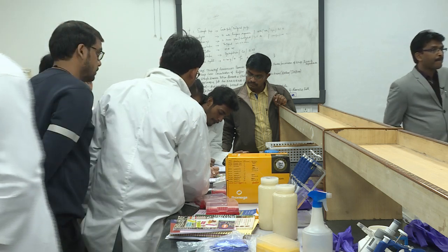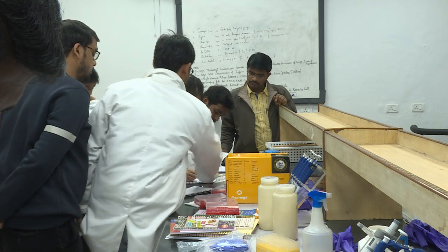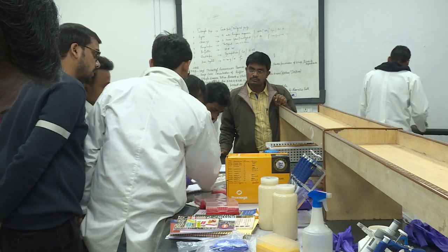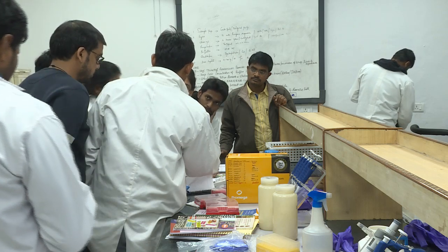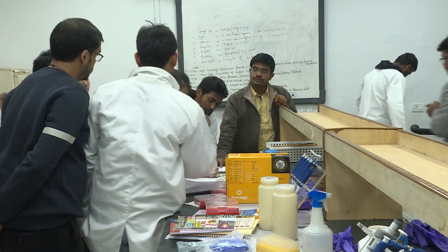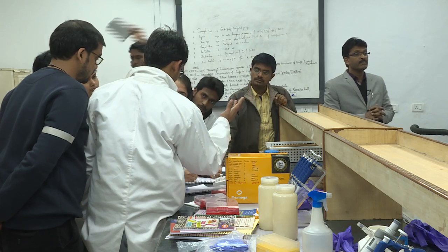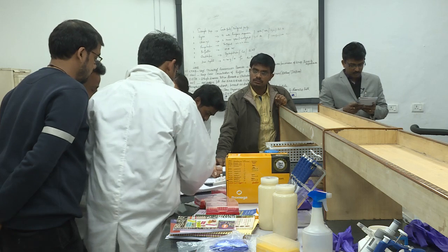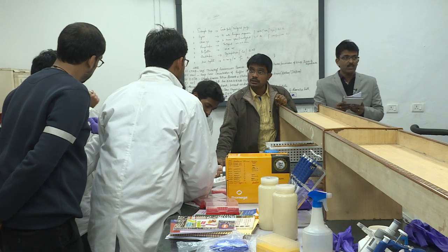Picomole, 10 to the power minus 12. Any group completed? Yeah. Show me the data. Group number? 10 micromole, it will be 10 micromole. This is Ralstonia? Pseudomonas.